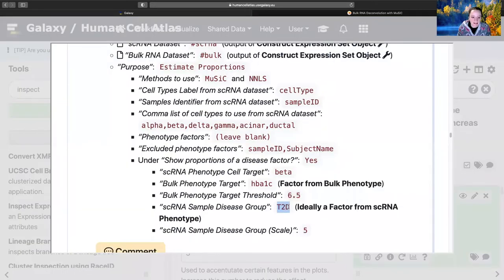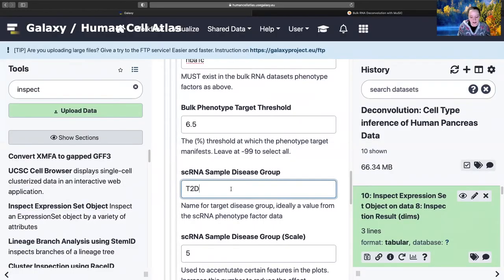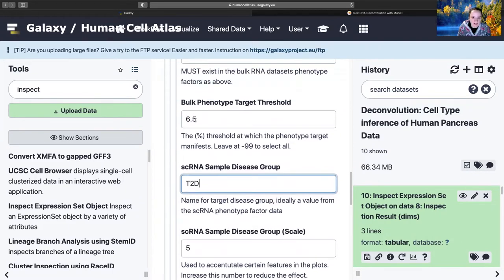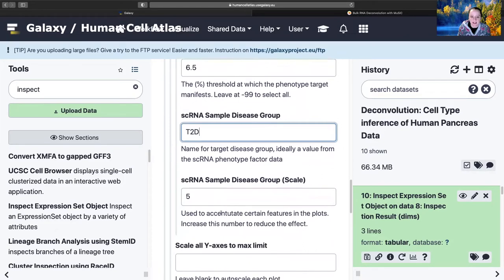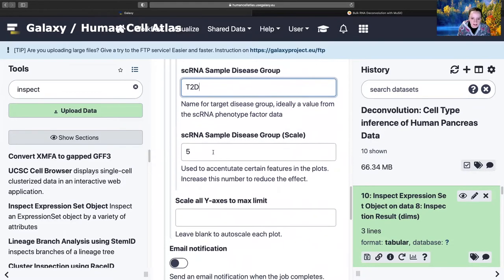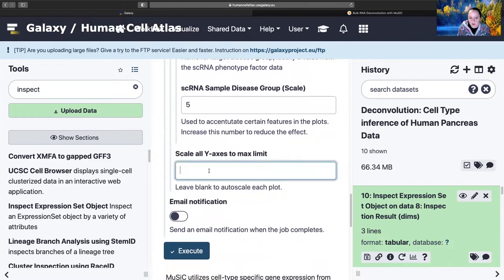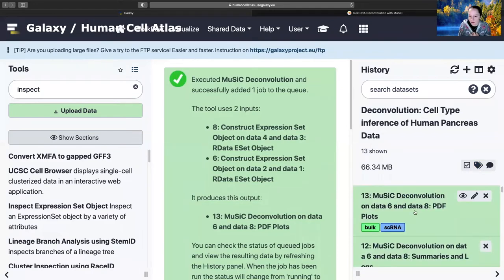Cell target - we're going to put beta. So 6.5, that's the number we're dealing with. This doesn't actually have to be from that. Ideally, your single cell dataset has some disease cells in it, but in this case, this is just going to define it in the graph. Anything that hits this criteria of HbA1c 6.5 in the bulk is going to then have the T2D defining it. Doesn't actually have anything to do with your single cell dataset. Sometimes you will want to do this. Otherwise, the axes become quite misleading. Through the magic of television, all done.